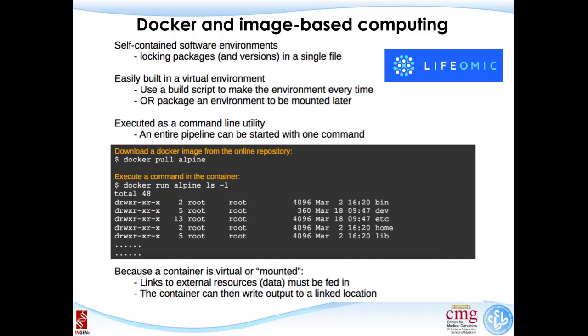And we spend sometimes weeks just installing these tools to get them to work. With Docker containers, you don't really have to install anything, right? Someone's already built the container for you, so you just open up Docker with that container and it does what you need it to do. The other cool thing is that it packages as many steps as you want in a single command. So you can run an entire NGS pipeline with one command. And that can also define the resources and automatically detect and configure how many processors and components you need to do this kind of stuff.